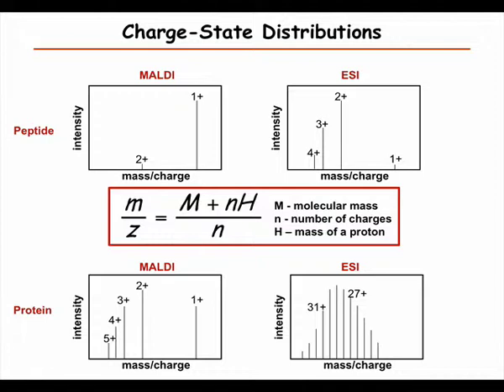And in this process, you get some neutral molecules, some of them charged. It's a complicated explosion, of course. But in this process, you get some charges attaching.